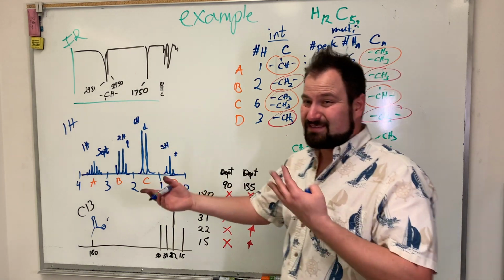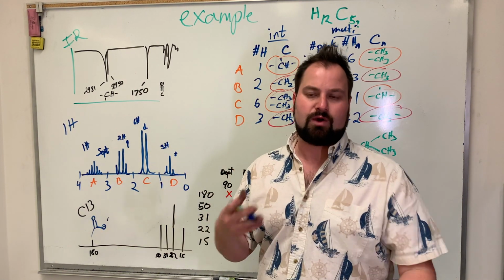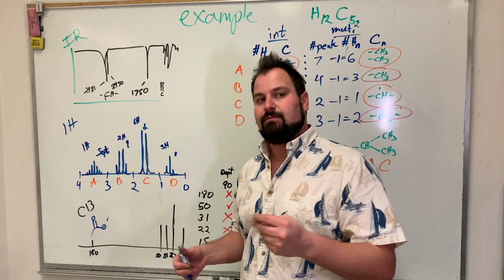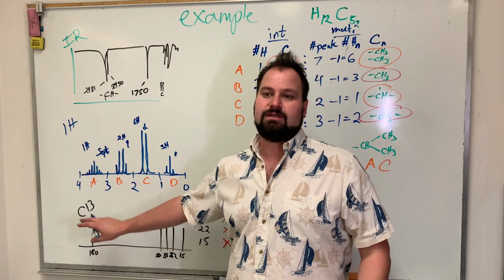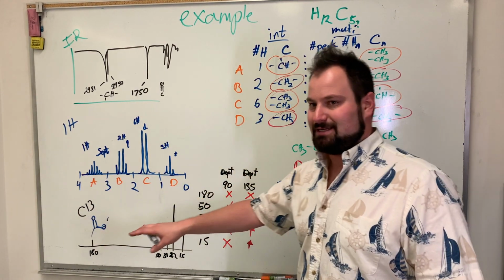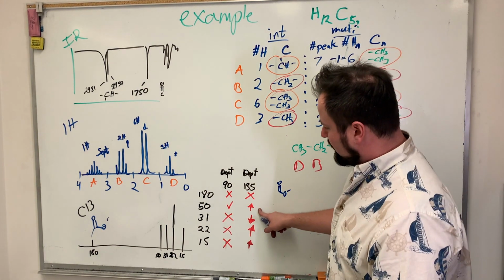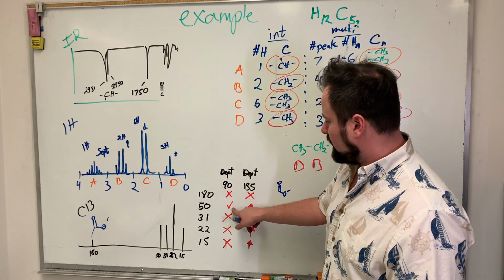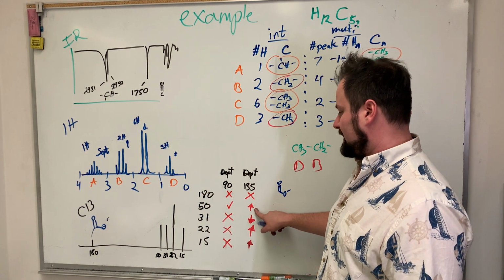But of course, these can be other things. You do want to look at the problem given, or sometimes you're given additional information that will say, oh, this is definitely an ester and not an amide or something like that. I'm going to say it's an ester because I made up the problem and I know that it is.